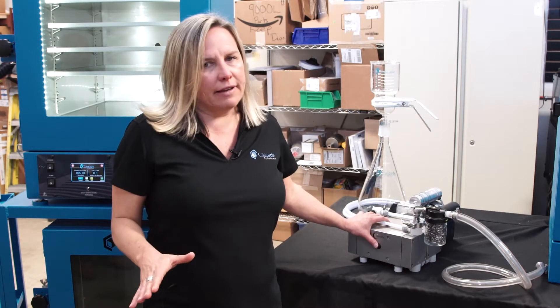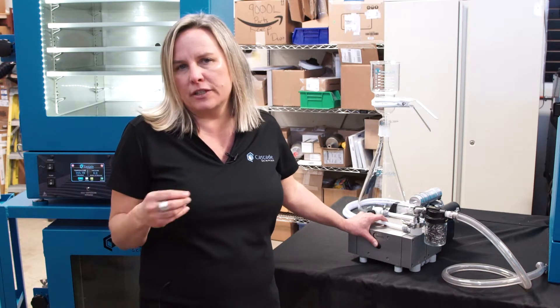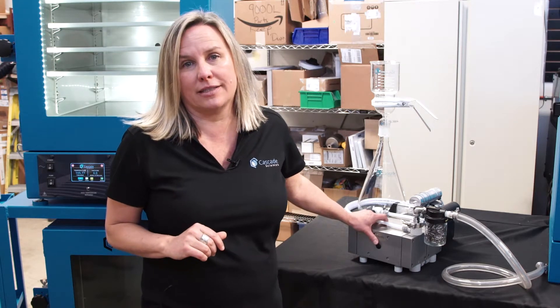Just a great value on a really popular pump for vacuum ovens and rotary evaporators. Just wanted to make sure you were aware of it and take full advantage of the cost savings.